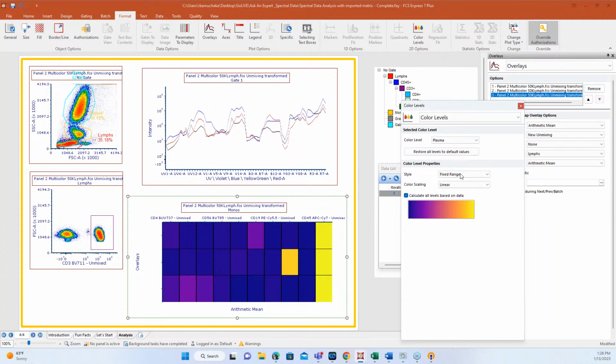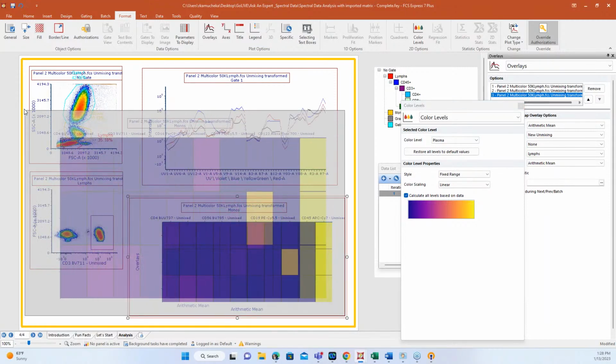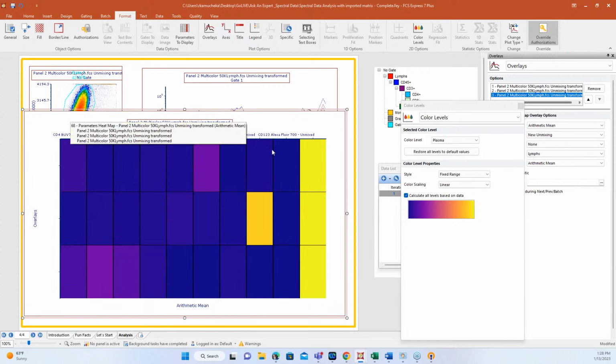I think those parameter heat maps and changing these color levels around is a really good way to use this as a screening tool if you wanted to. So add these overlays and get a really quick idea. It's like, okay, that one really bright yellow square, that might be something. That gives you a lead into going into something else. So maybe you don't have to draw a billion dot plots to find something different that's going on.